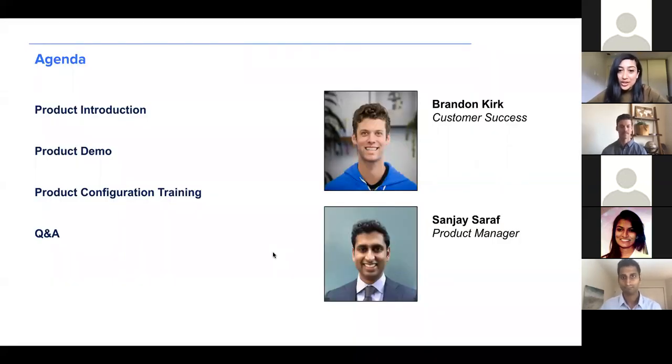Today, we are thrilled to share the recently launched Benchling Insights product with you. With Benchling Insights, all of you, our customers, now have a powerful solution to query, visualize, and collaborate on the data you've been collecting on Benchling, all seamlessly within the product. We hope that with Benchling Insights, you now have the tools to make faster, more informed decisions about your scientific pipeline and operational processes.